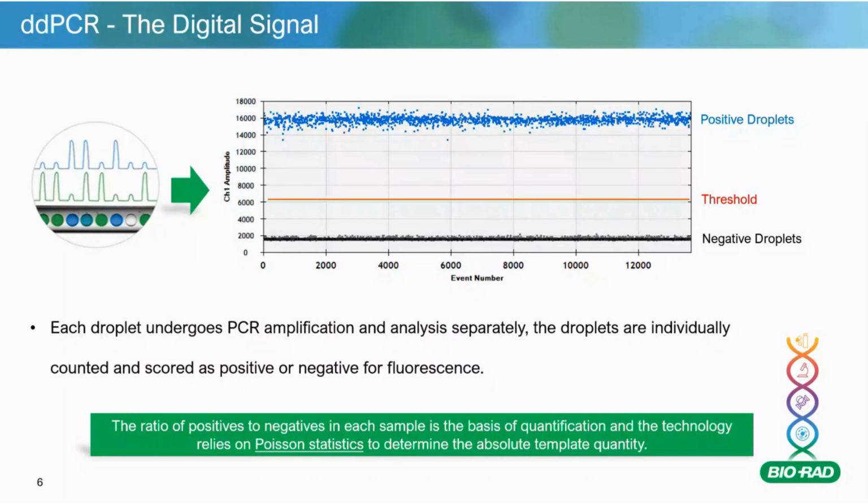Now, remember I said to you, digital PCR has two distinct features over other PCR methods. 1, it's similar to real time, it has fluorescence. 2, it's similar to endpoint. The reading is at the end of the cycling process.